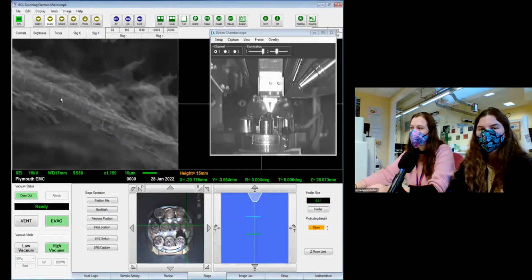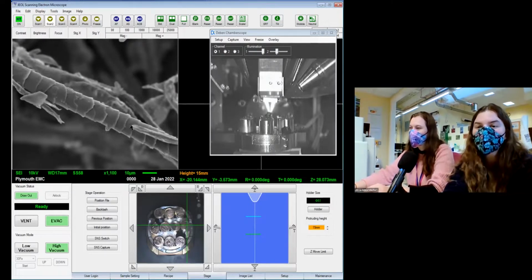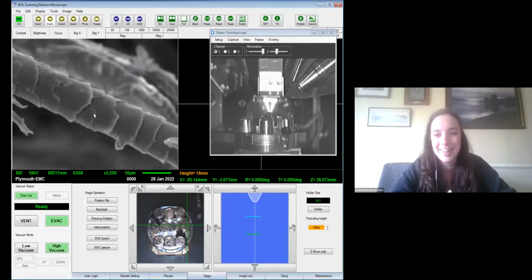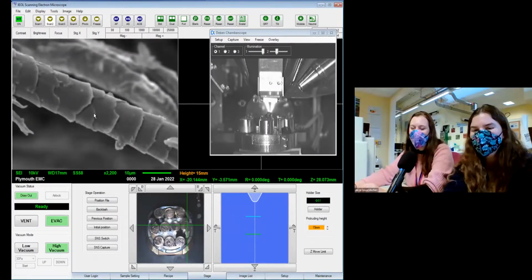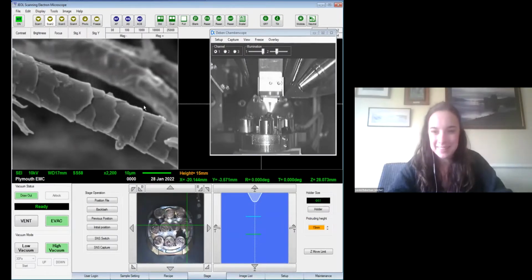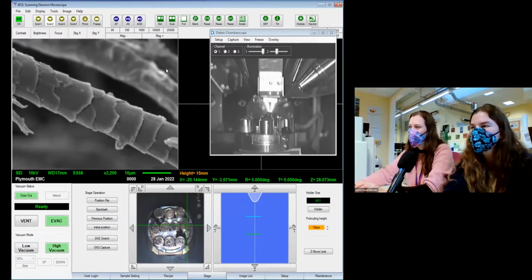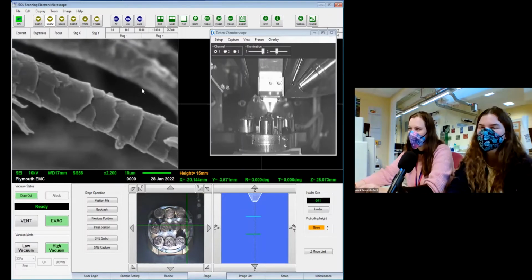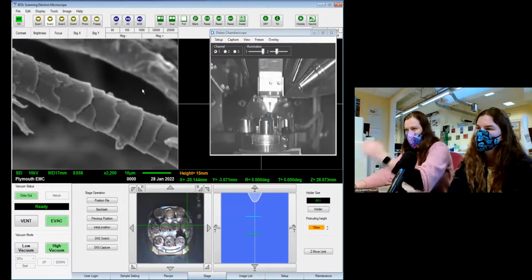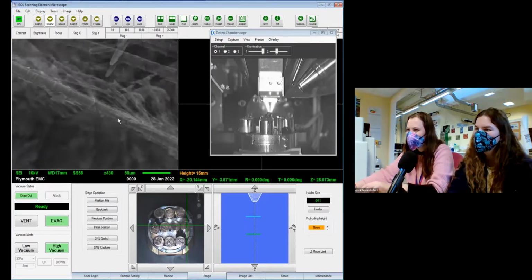Oh, there's a camera. Wait, let me just replace the spotlight. Yeah, there you go. You can see there's a sleeping Buzz. Oh, hi Buzz. Hello. So cute. I can see some charging in the background there. It looks like the image is moving in the background. So there's just some charging happening back there, which is fine. Oh yeah, that is moving. Let's stop that one. Let's try again.